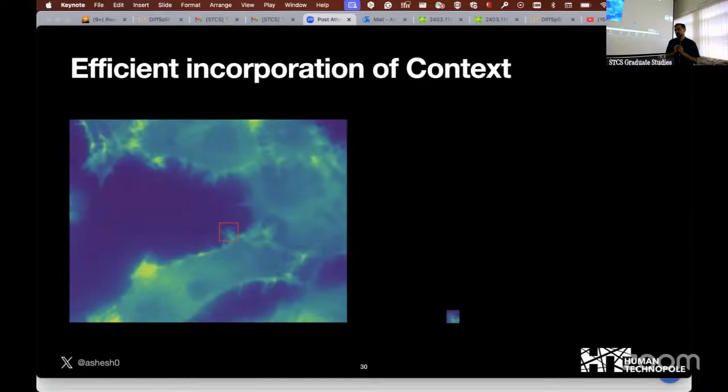They are different because foreground, background means that in the background essentially there is nothing, right? You could threshold, that's what you're saying. But here you have two actively present structures, they are overlapping. For example, I don't have the results for this image, but essentially there are two structures overlapped here. So it is not trivial to separate them through, let's say, classical measures.